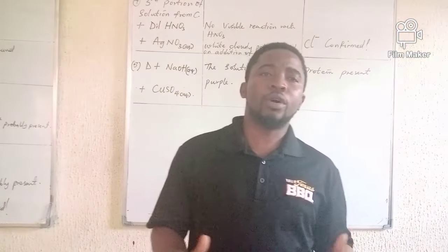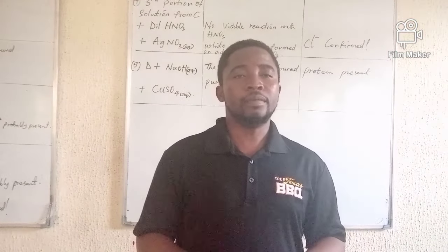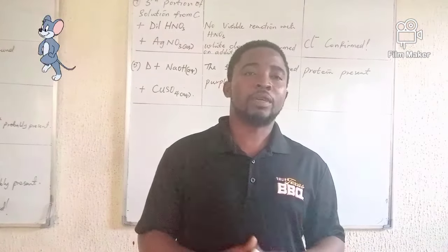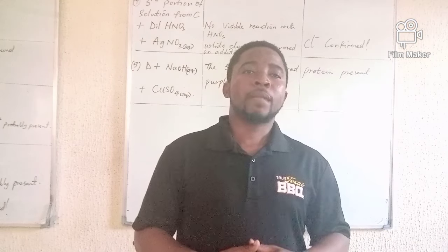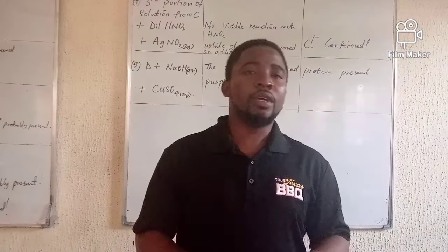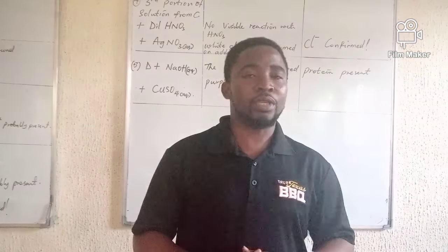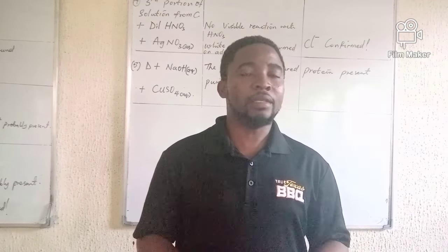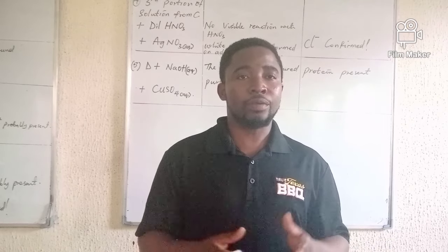Welcome back. Based on the salt specimen that came out and the reagents that we were asked to provide for the students, I want to give this instruction to students and also chemistry teachers out there. We are working together to achieve a collective goal. And what's our collective goal? It is just to ensure that these students do well in their exams, and to properly guide them to do the right thing. The analysis of zinc chloride and a solution of powdered milk is what I'm going to do now, and it will guide us into the proper thing.